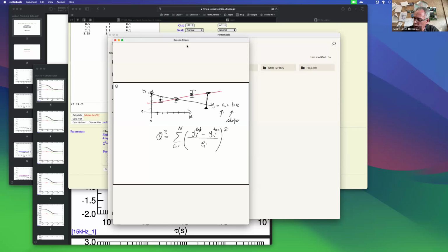I must not take the risk of getting a sum equal to 0, because 0 means basically that there will be as many positive differences as negative differences. And that is erroneous. So I'm using the square to make sure that all these differences count as positive for this sum.